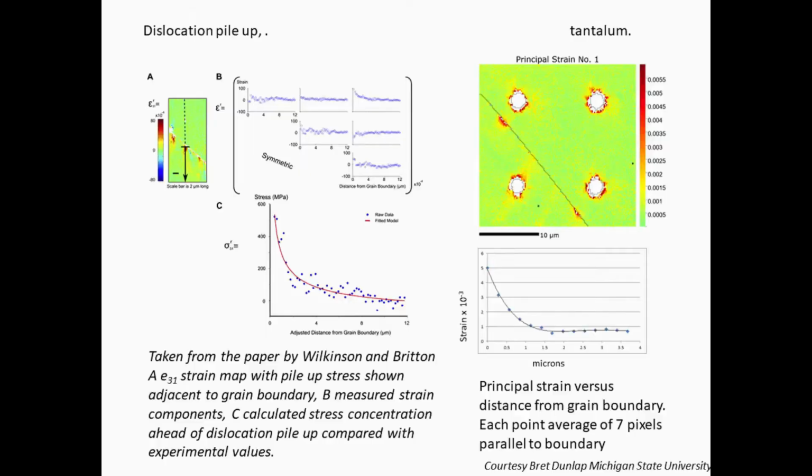Now here's another couple of examples. This one from a paper with Wilkinson and Britton, which I love, because it shows the stress concentration against a dislocation pileup. Things we've talked about ever since we were undergraduates and never seen it experimentally proven.